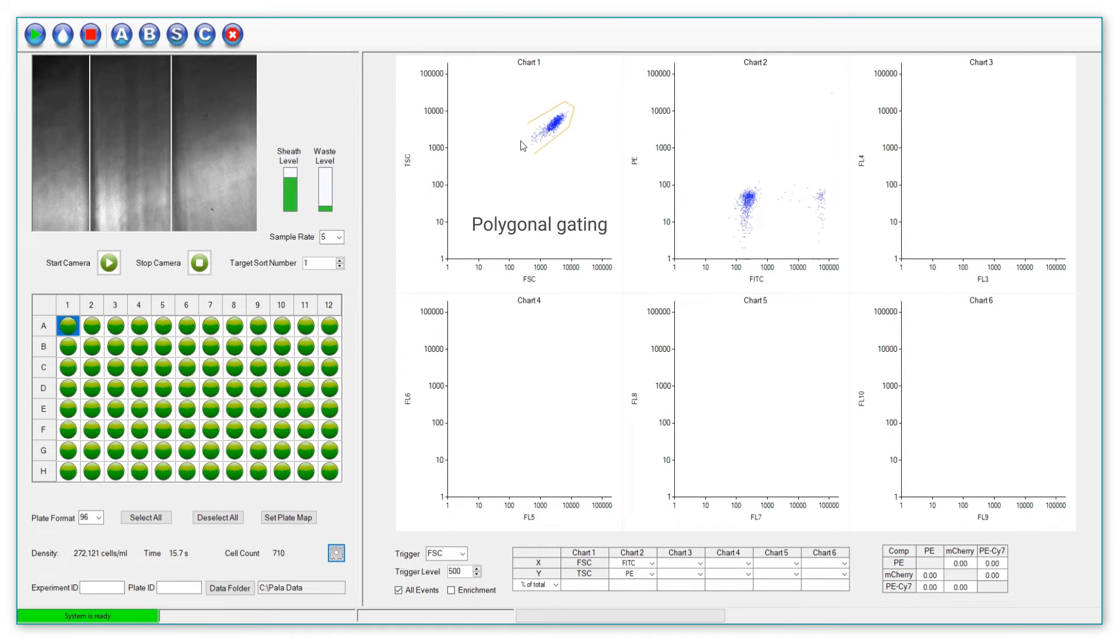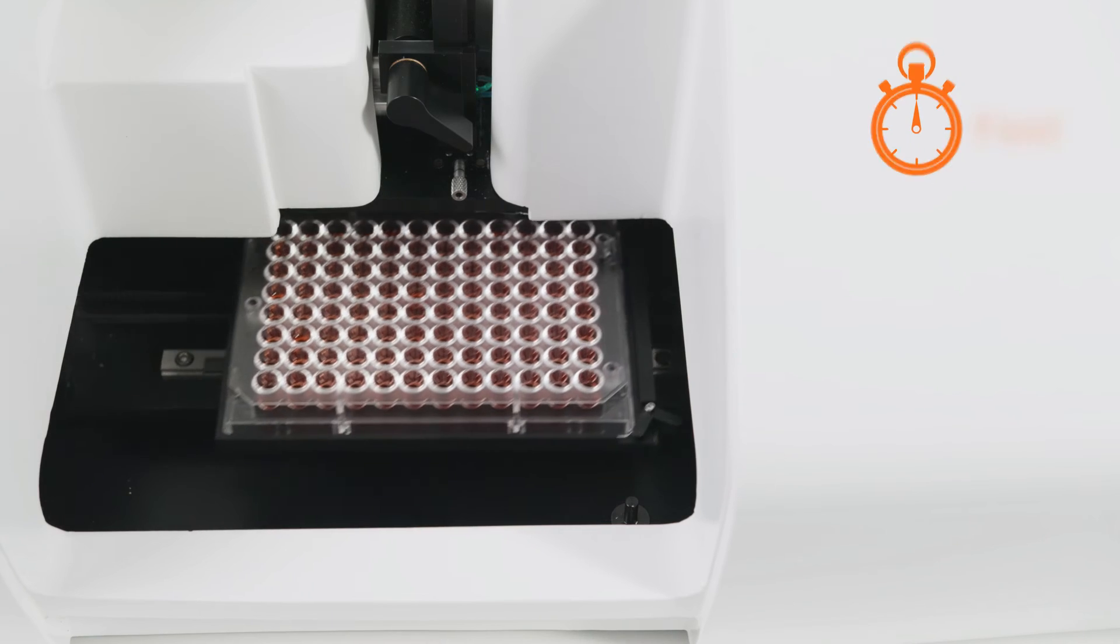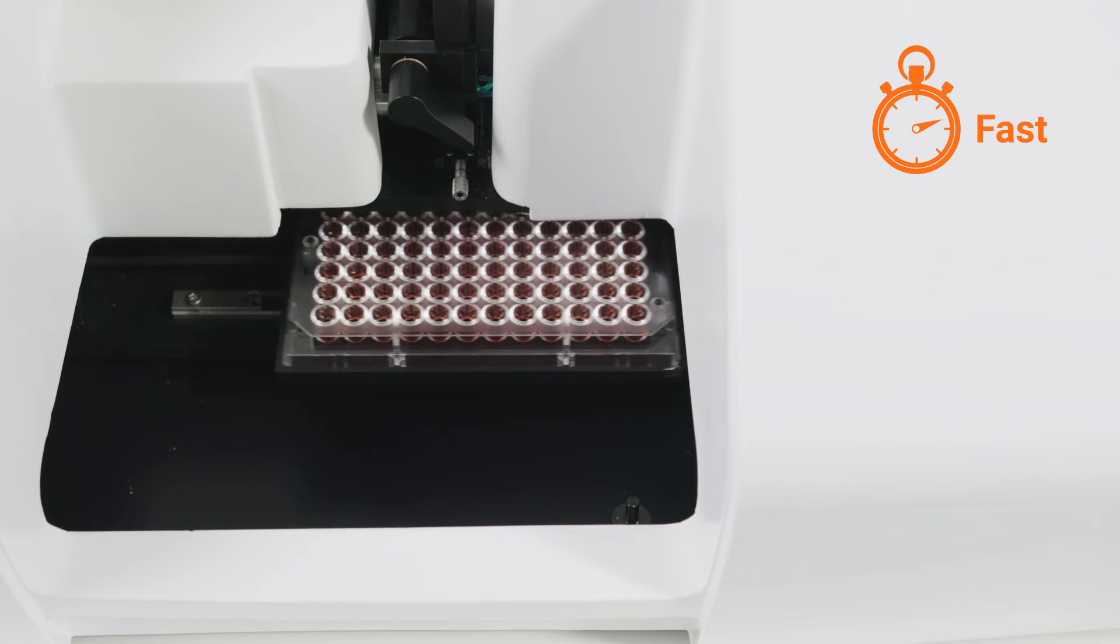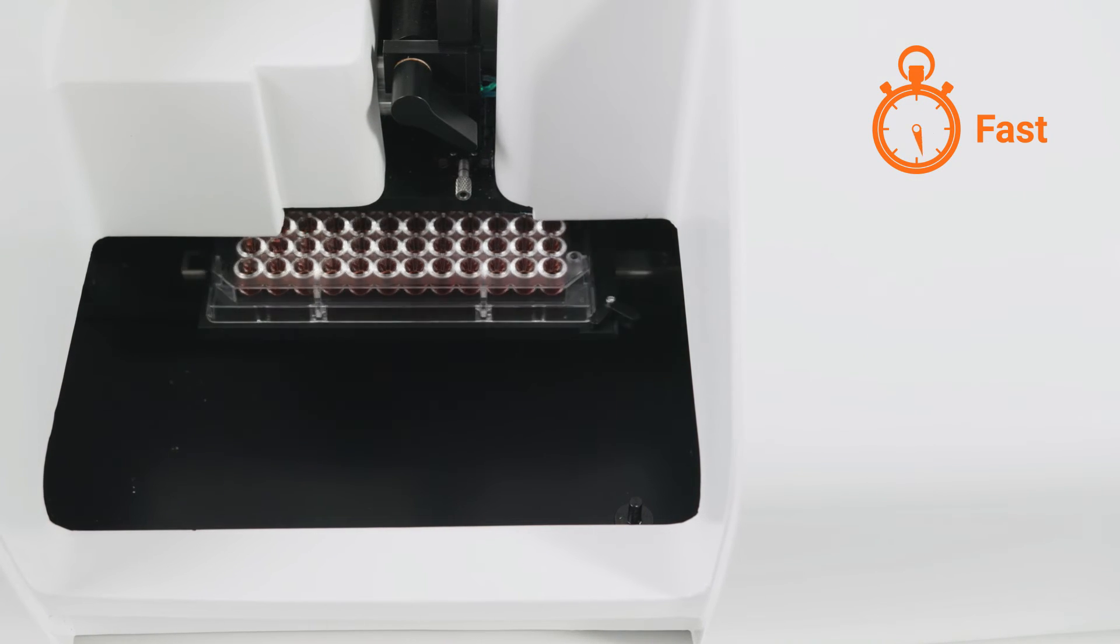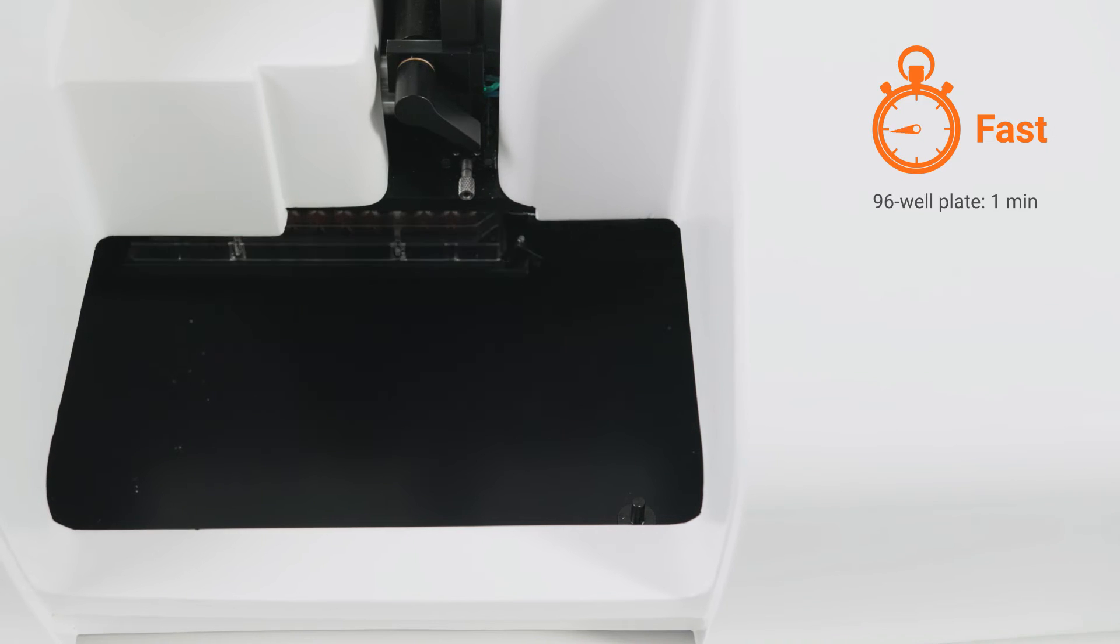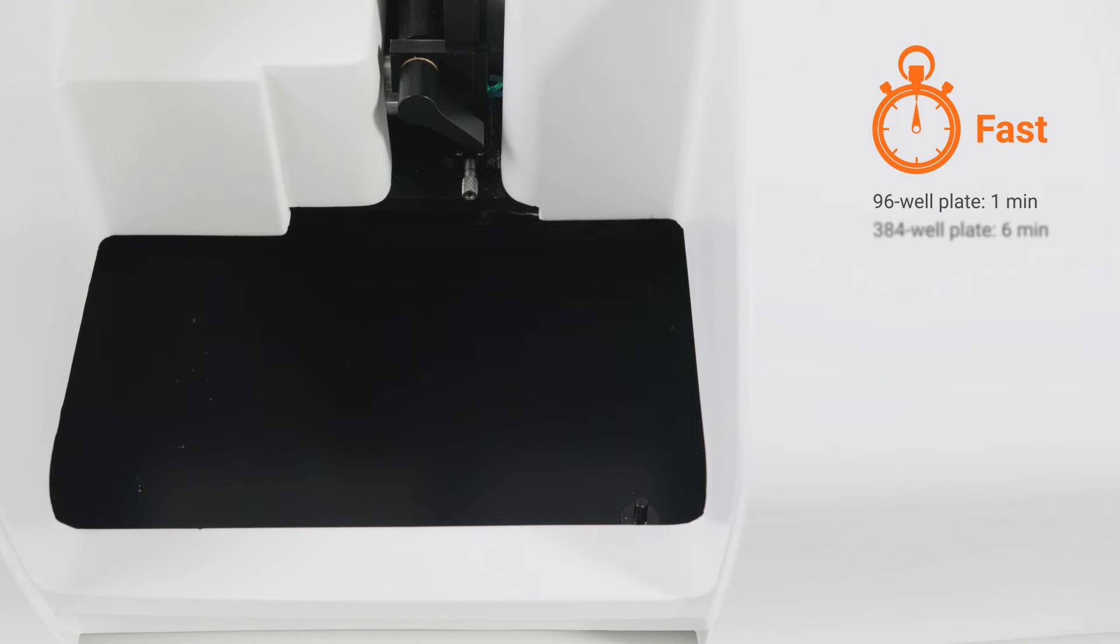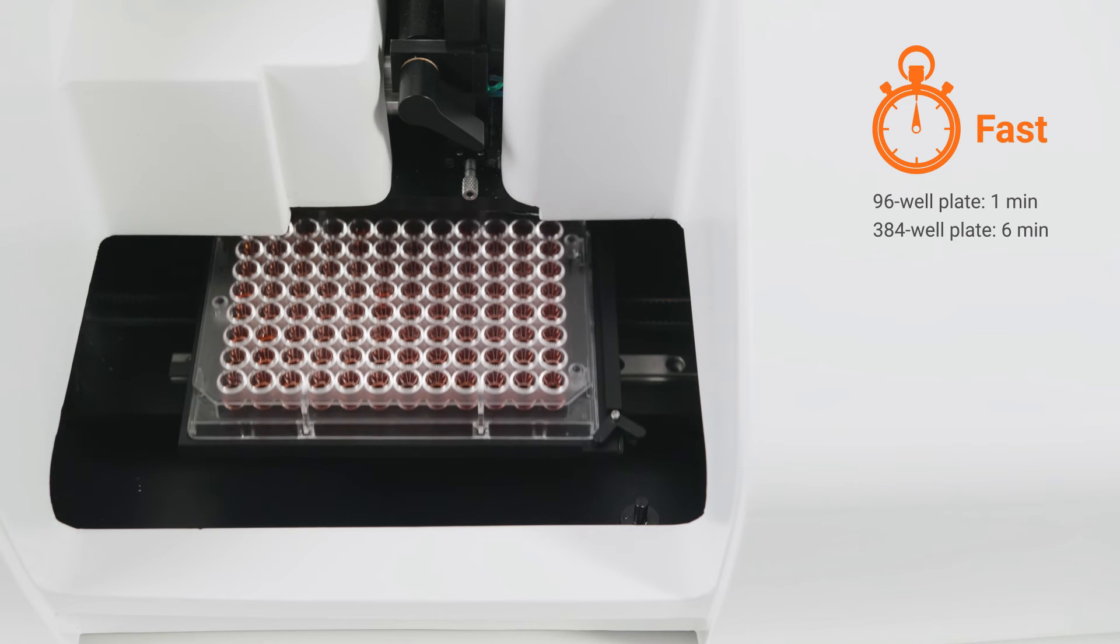Next, simply set up your gating parameters and start the program. The Pala quickly dispenses cells into both 96 and 384 well plates, within one minute for a 96 well plate and six minutes for a 384 well plate.